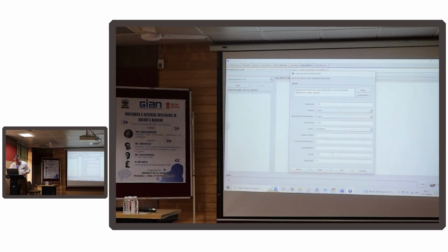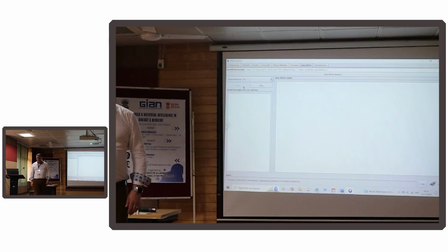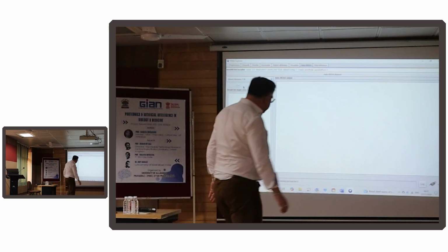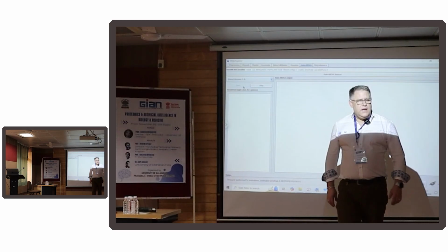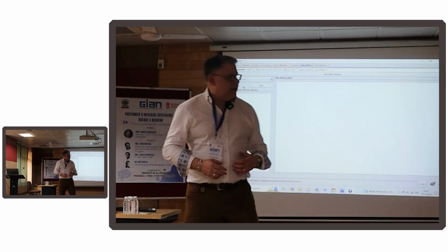So I'm going to not run this for 15 minutes. I'll run it for 5. And if I click OK, I want to use the same output. And then I just click Start. And as with all best machine learning algorithms, not much happens on the screen because you don't want it to, because it's a waste of resources. But working in the background, that's telling me it is. This is now looking at a whole load of different algorithms, different solutions.